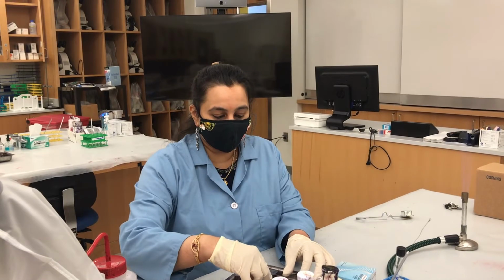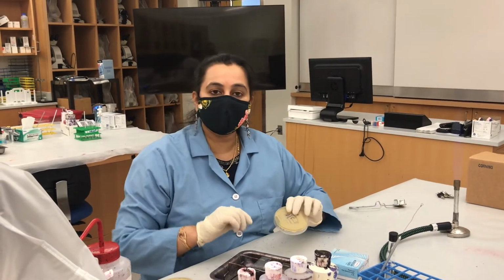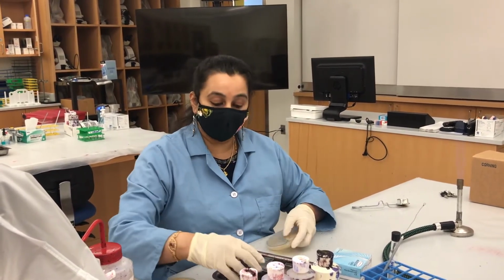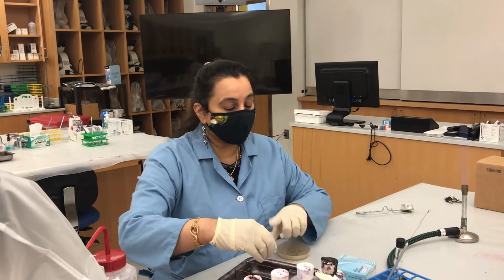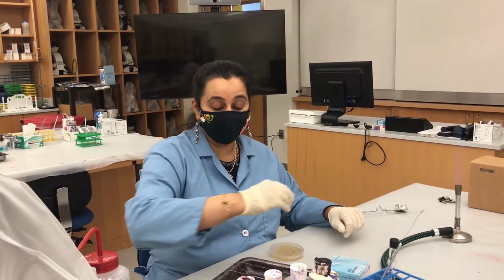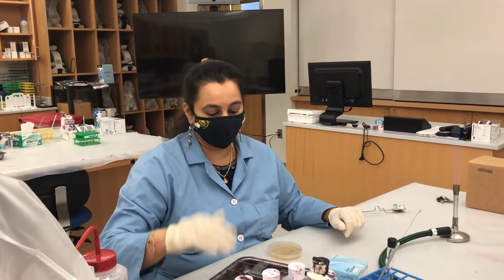One of the slides has the bacteria on it. I added the solid culture, wherein first I put a little bit of water and then nicely mixed all the cells so that the cells are not clumped up. And now we need to wait till all the liquid gets dried up. So the next step would be to heat fix the cells by running the slide through the flame gently. But before you do that, it's very, very important to let the slide completely dry.